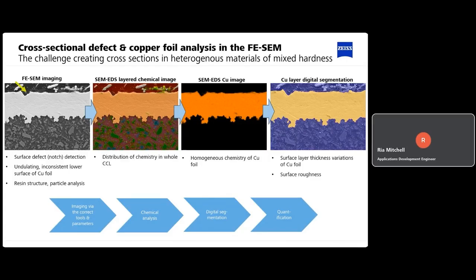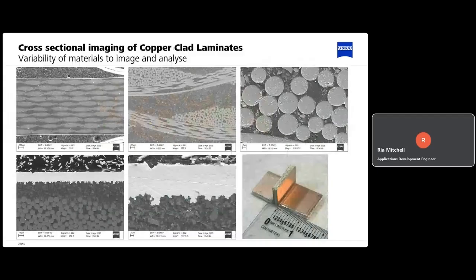This slide just shows a variety of other features that we can see in the copper-clad laminate. So here you see a full width and you see that weave, the different weaves of the fiberglass running through the center part of the sample. You can see various different magnifications of the cross sections through some of those fiberglass fibers. And then we have some really nice views at the bottom of this copper layer and how that interacts with that interior non-conductive layer.